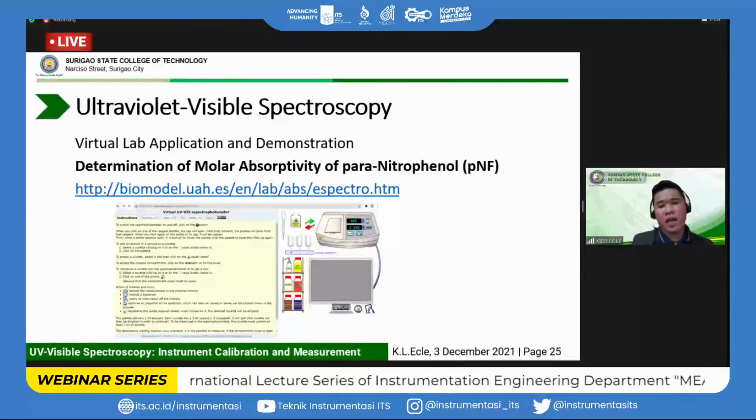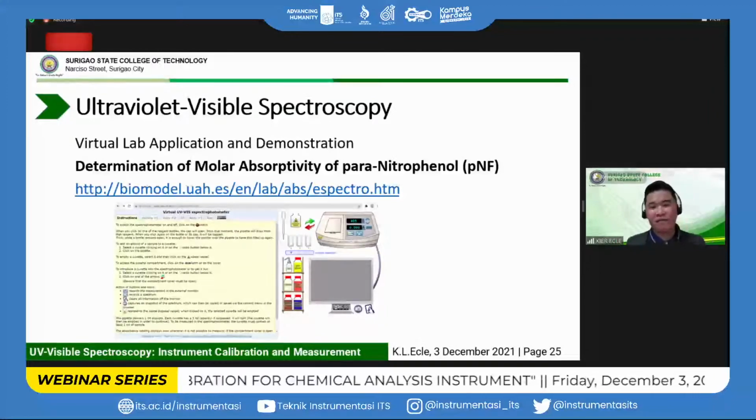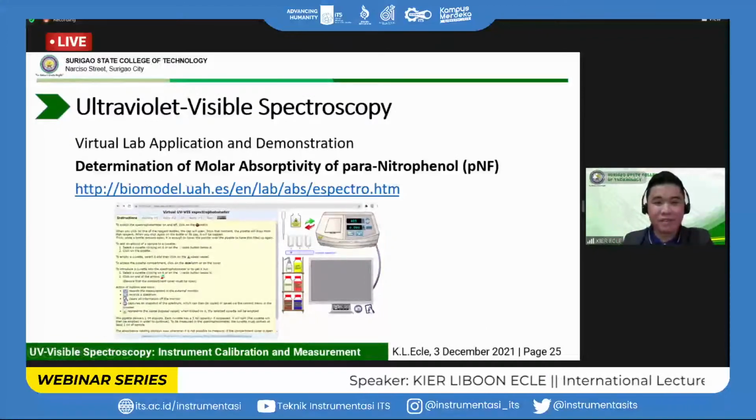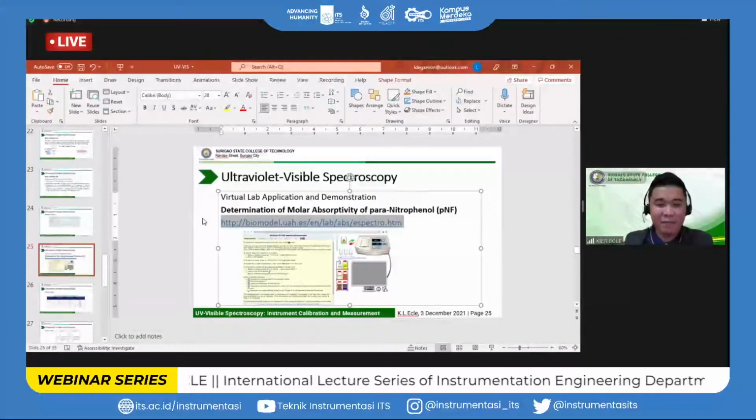Okay, so I have here a virtual lab application and demonstration entitled Determination of Molar Absorptivity of Para-Nitrophenol, or the PNP. I can also share this link to you, so that you could also open the virtual lab.